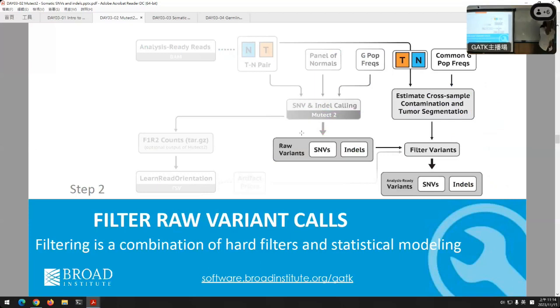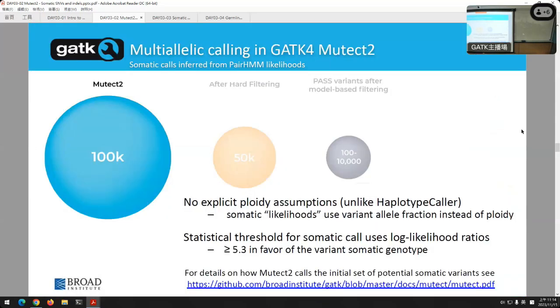We're doing, at this point, even more filtering past that stage. Like I said, we want to be very careful in the somatic case. There's further filtering here. That box I mentioned was little, but there are actually several types of filtering that I'll go into in turn, okay? As we mentioned, in many ways, the first test, and I have them listed like this. I'll talk about them one at a time. That's mostly because I can't carry two conversations on at once. I speak quickly, I know, but I do have limits.